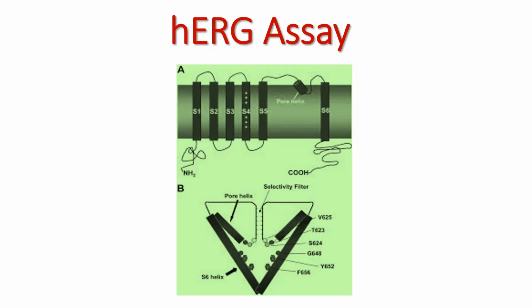In this lecture we are going to study some assays which are useful for the detection of hERG channel. Several methods are proposed to investigate the QT prolongation, and it is important to screen the new chemical entity or drug molecule on hERG channel.